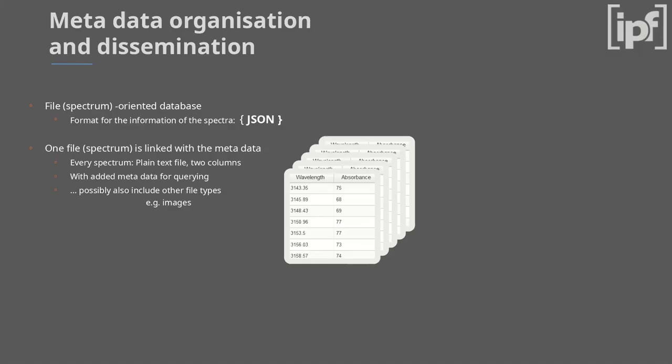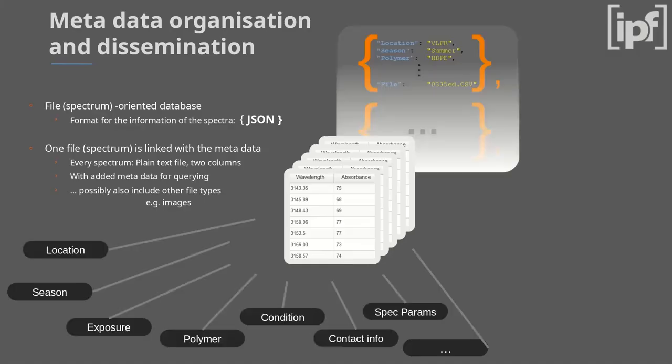And then the rest of the file name, I just show you this, the rest of the file name that I show here would be the hash of the spectroscopic data content of this file.